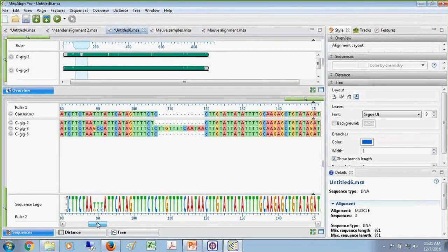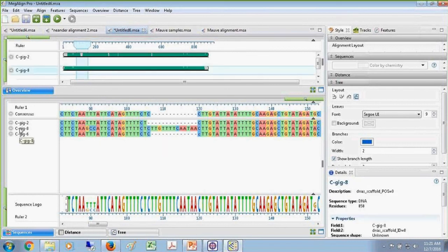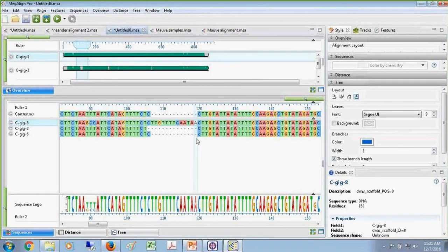And what I was doing, granted I had a lot more of these, I would be able to go through and I'd be able to see motifs that were characterized among the different clone sequences. Here, clone number 8 looks kind of different, so I'm just going to move that off to the side to group these lower 2. Now, only looking at 3 sequences, it's hard to say whether these lower 2 are allelic versions. There's some really minor differences.